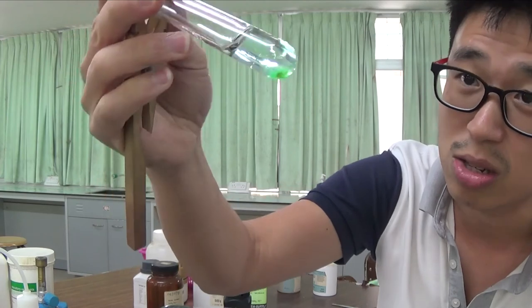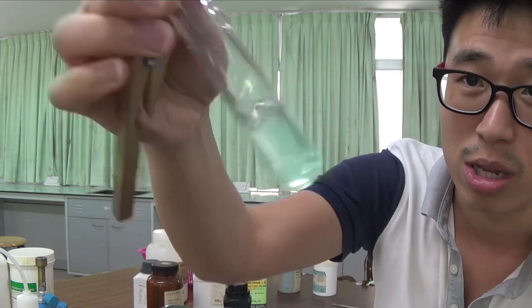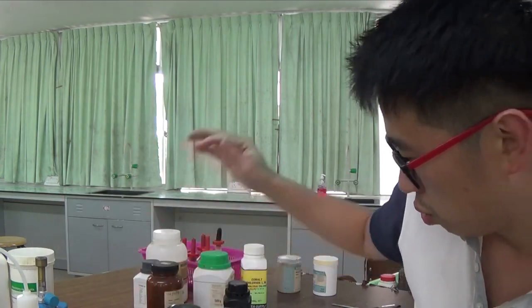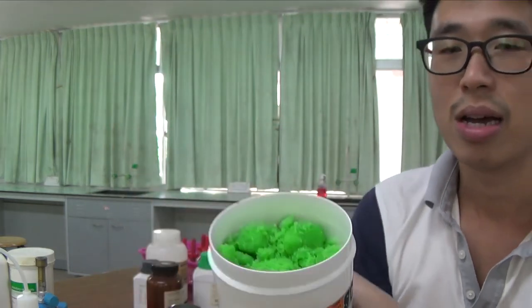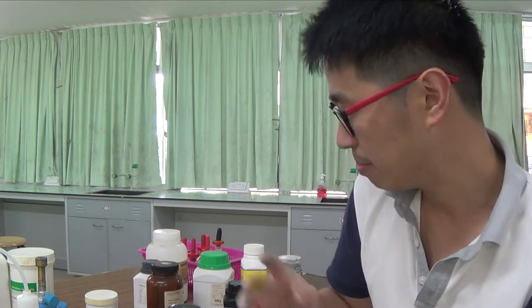Actually, this was the nickel(II) compound that went a bit yellow after I heated it strongly. Just now it didn't look like it was going to dissolve, but now I think the green color solution has started to return. There was the very nice color of nickel(II) chloride hexahydrate. As I mentioned, nickel(II) is not really a case study in transition metal chemistry, especially not for O level or IGCSE chemistry. It's not a case study in A level chemistry, but then they can obviously ask you some stuff which is beyond what they normally ask because it's within the scope of the first row transition metals.